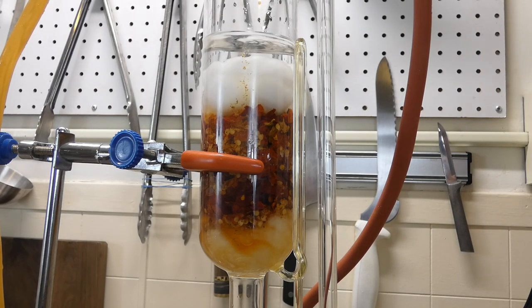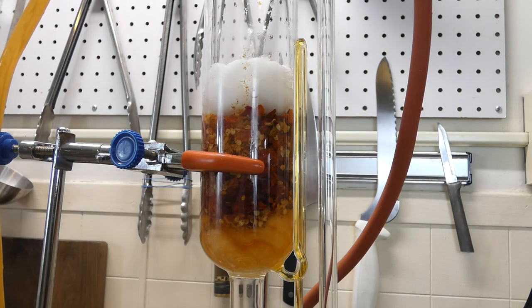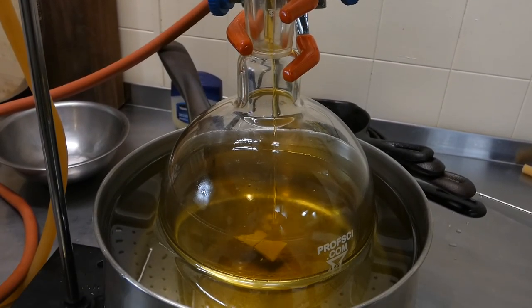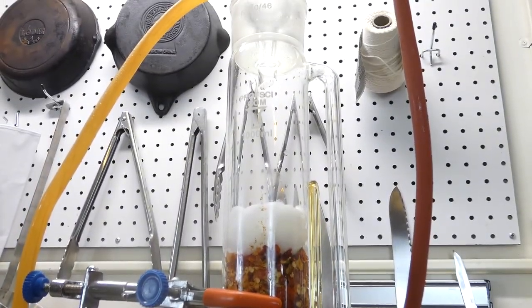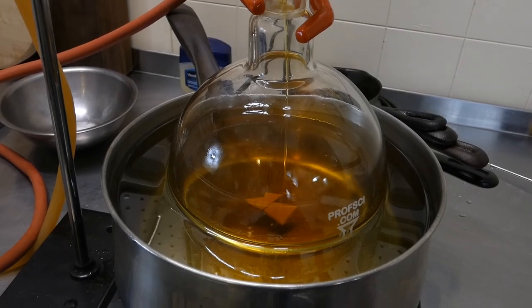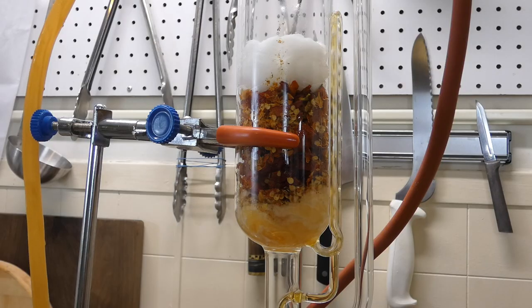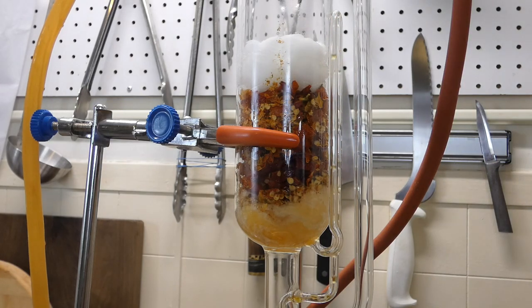There it goes. And as you can see, it's going down into the flask. And into there. Boiling has completely ceased, and as you can see up top there, maybe you can't, it stopped dripping as well. Oh, it's dripping a little bit, but very slowly compared to what it was. So we need to get this back up to temperature as soon as possible and continue this process. And it's starting to stop. Bubbles are coming out, and it's gonna start recondensing once more.